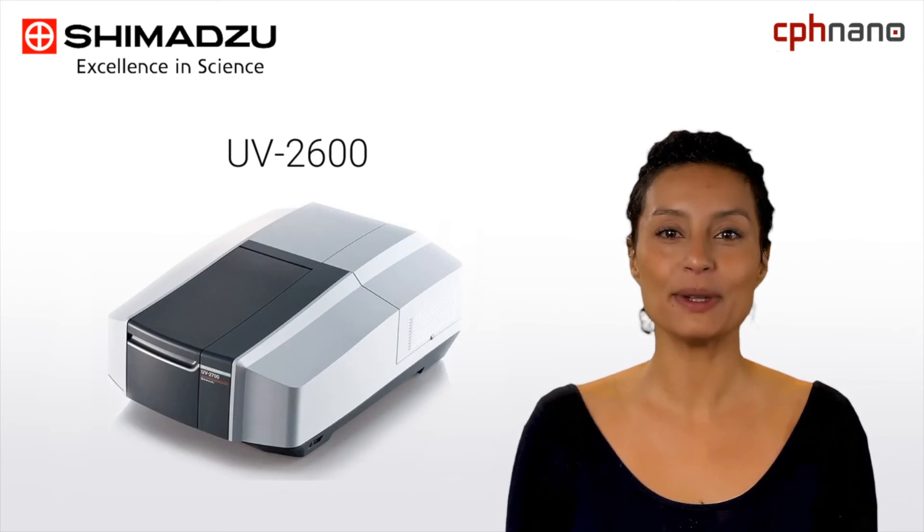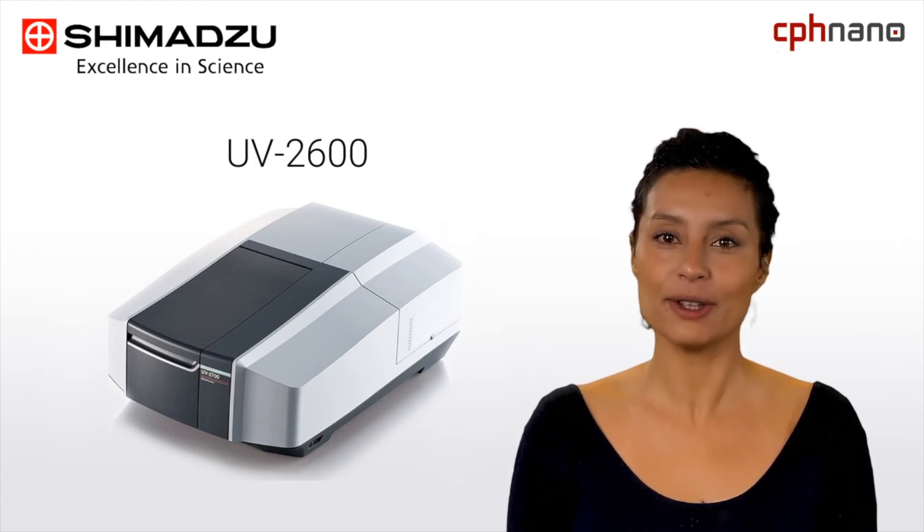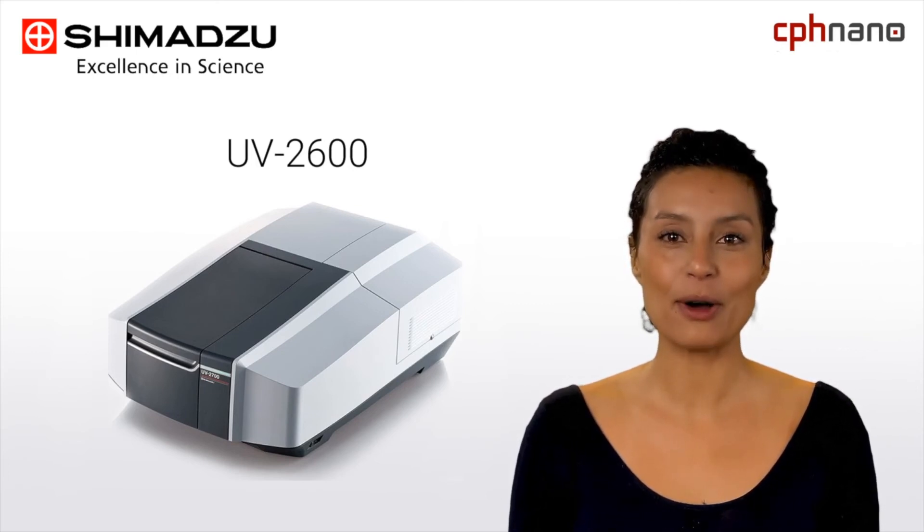For maximum performance, the UV-2600 spectrophotometer is the most advanced of these three models, capable of measuring wavelengths up to 1,400 nanometers. This enables the user to perform measurements within the near-infrared region.